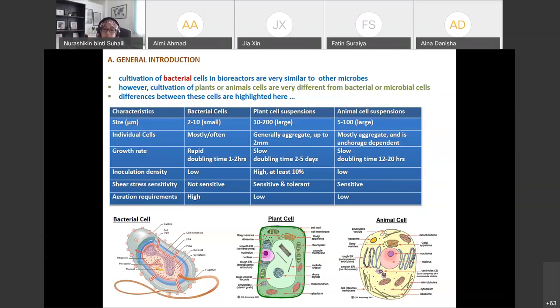When you grow the inoculum or seed culture, you want to get more cells to start your fermentation later. I hope you understand this. That is the concept of inoculum and seed culture. Normally it depends on the organism. For E. coli, we grow the inoculum for 12 hours, or 15 hours. It depends on the organism as well.